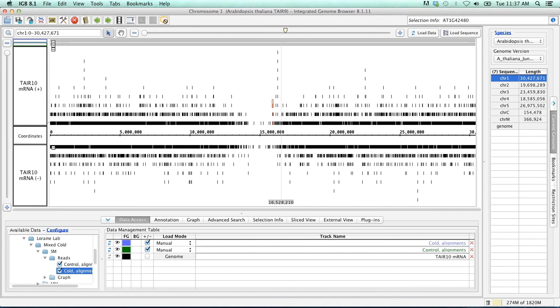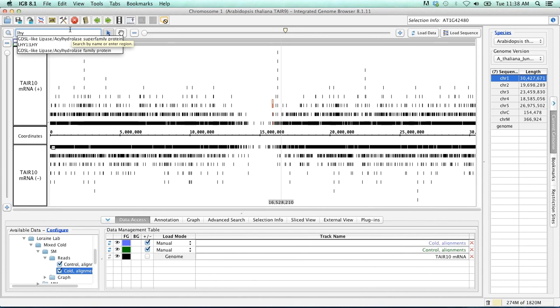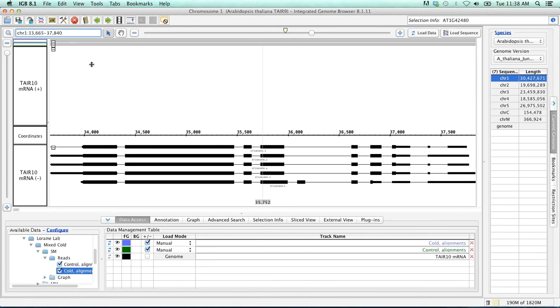Okay. So our analysis has indicated that we have a gene of interest that is very important to our model organism. Let's do a search for the LHY gene. Up here in the search bar, I'm just going to type in LHY. This is going to identify right here, so LHY1 or LHY. Click on it, and it should take us to the LHY gene model.